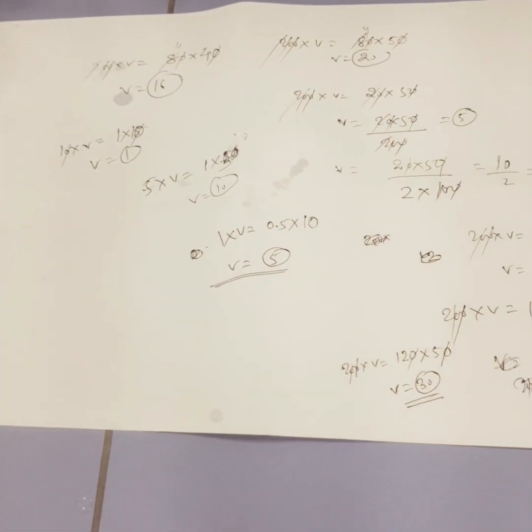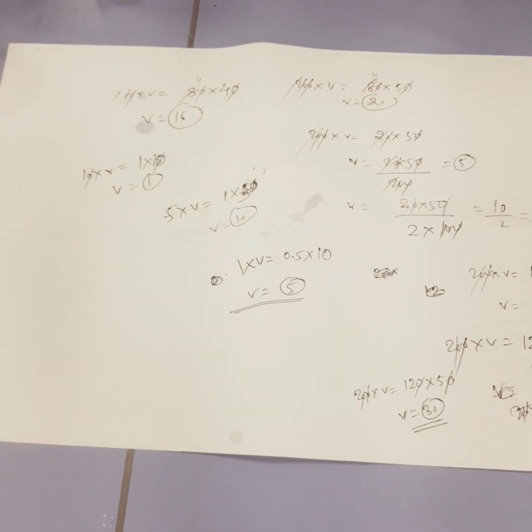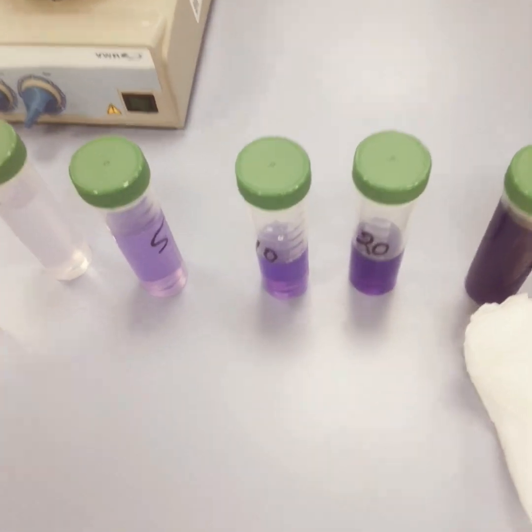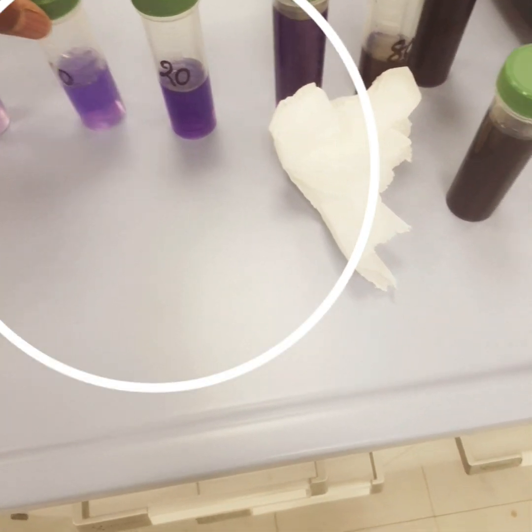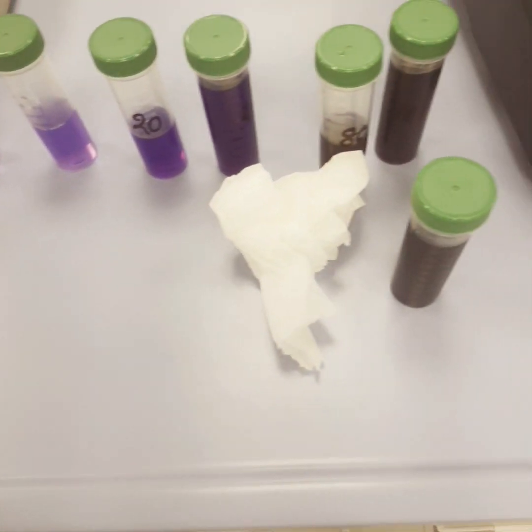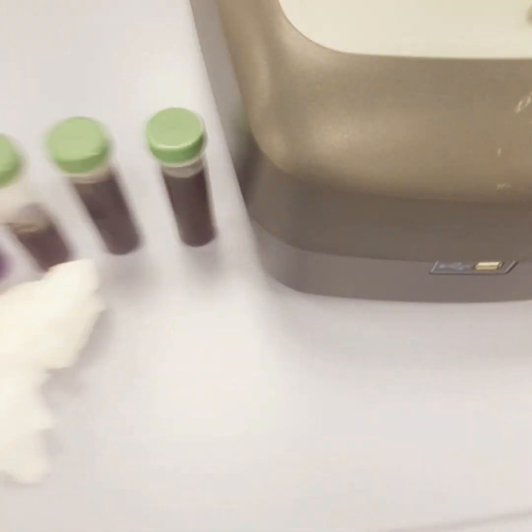So already we have seen these concepts in our old videos, how we prepare from the higher stock to the lower stock. So here already I have shown you that this is my higher stock. For my higher stock I have gone down to 1, 5, 10, 20 and also I made 0.5 ppm also. So 0.5 till 120 ppm.